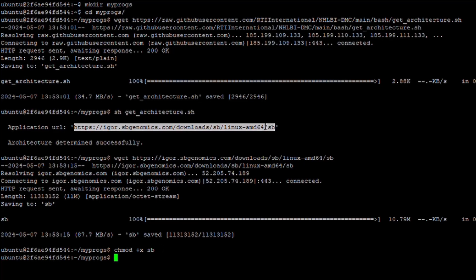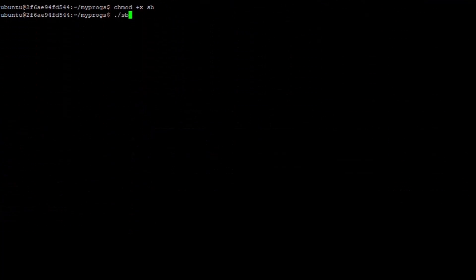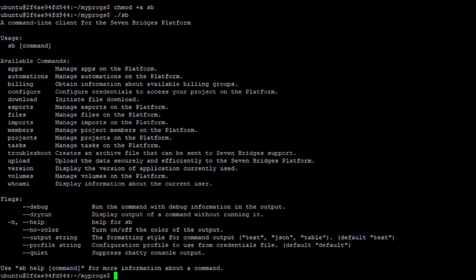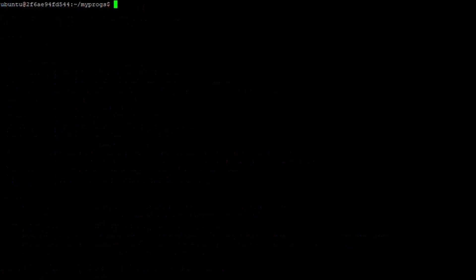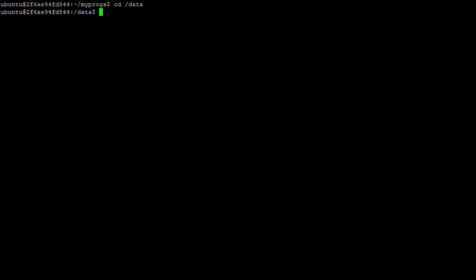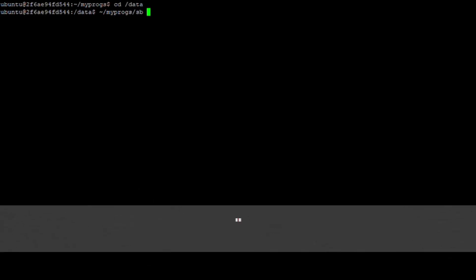You can issue commands from the CLI by navigating to the directory and issuing the command ./sb which brings up the standard usage statement for the tool. Alternatively, you can issue commands from any directory by providing the full path to the executable file. In this example, the CLI was installed in my home directory in a subdirectory called myprogs. So to issue a command to the CLI, I would use ~/myprogs/sb.